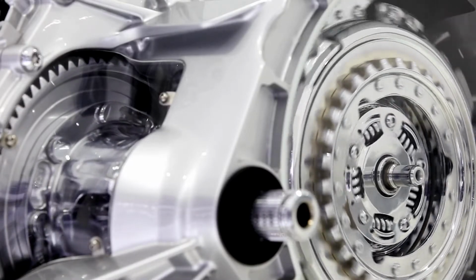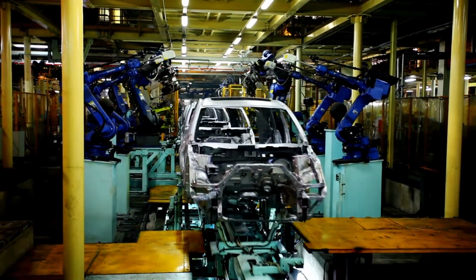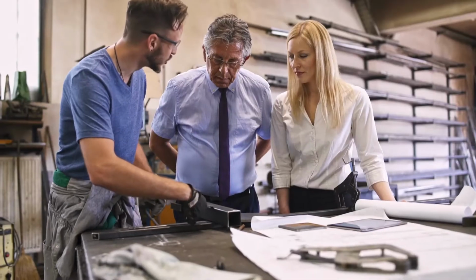Now, the purpose of Millipore testing varies according to industries as well. Let's try to understand those differences across industries one by one. Millipore in the auto industry is widely used as an acceptance criterion. Now, you may know that the majority of the components that go into a car are not manufactured by the car manufacturers themselves. They outsource this manufacturing to other vendors. When they supply these parts to the car manufacturers, they have to adhere to some sort of quality standard. One of these quality standards is this Millipore testing.